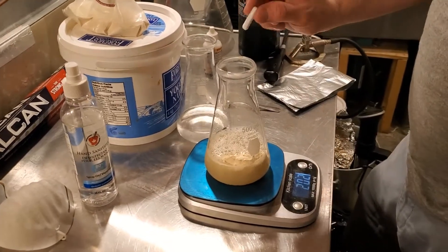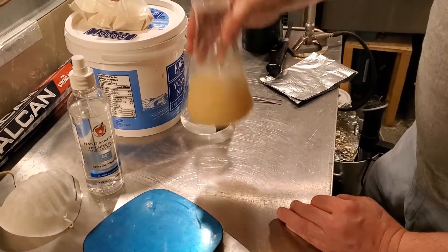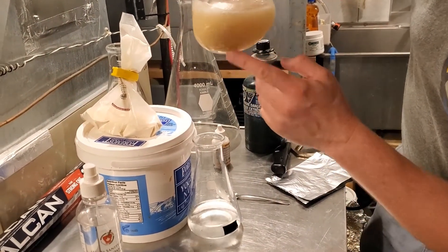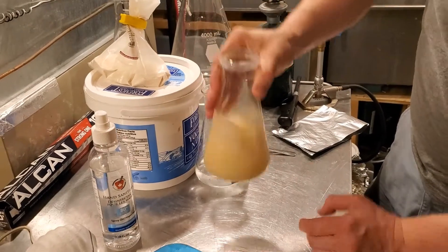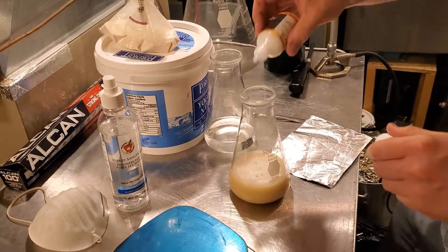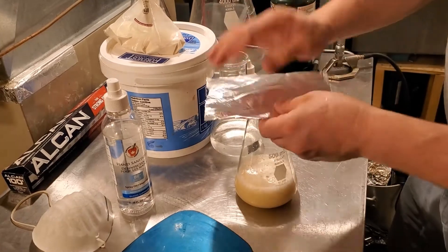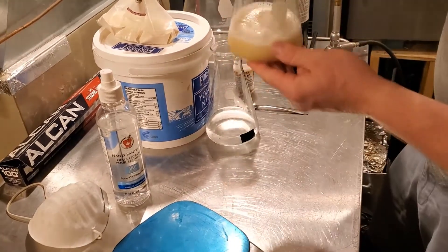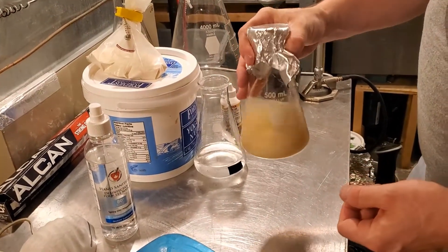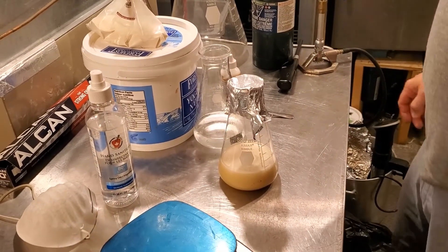I'll also throw in the stir bar and give that a little mix. You want to be careful and make sure you don't have any lumps of DME stuck to the bottom because that's a really good way to crack one of these flasks. Then just before I cover it up, I'm going to add just a drop of defoamer solution so when I hit a boil on the stovetop I won't have a nasty boilover situation. I'll throw the foil on there, and now it's time to take this upstairs and get it boiled so that it's relatively sterile and ready to receive the yeast tomorrow.